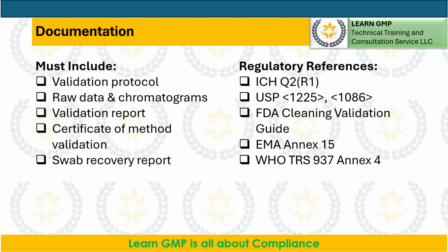Documentation must include validation protocol, raw data and chromatograms, validation report, certificate of method validation, swab recovery report, and regulatory references: ICH Q2, USP <1225>, <1086>, FDA Cleaning Validation Guide, EMA Annex 15, WHO TRS 937 Annex 4.